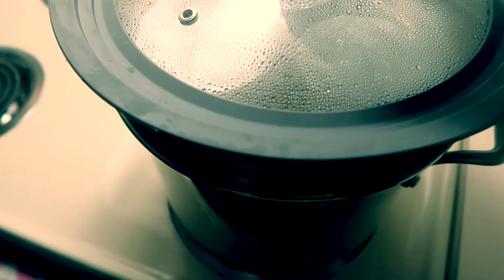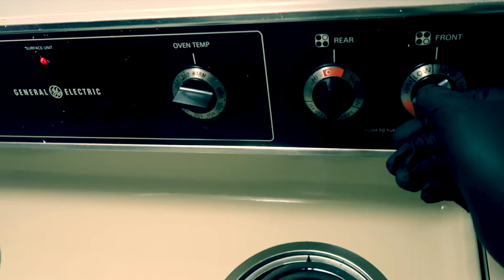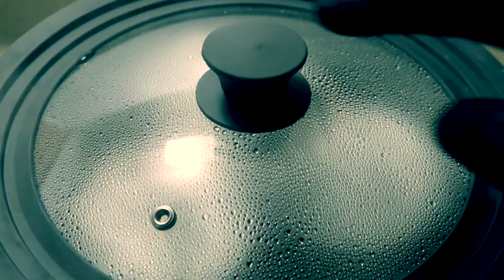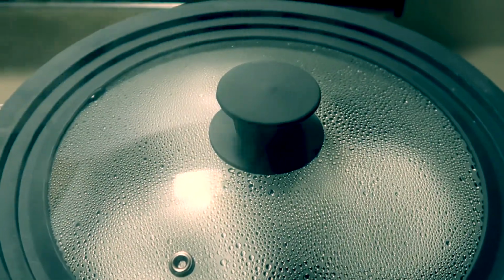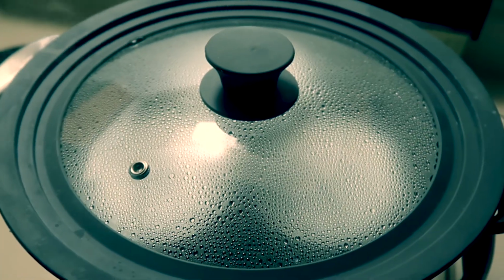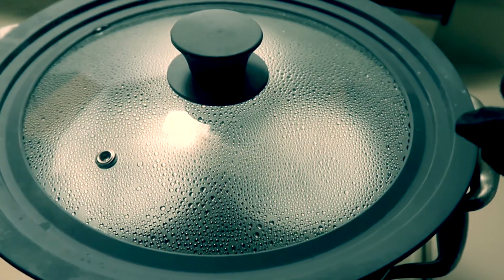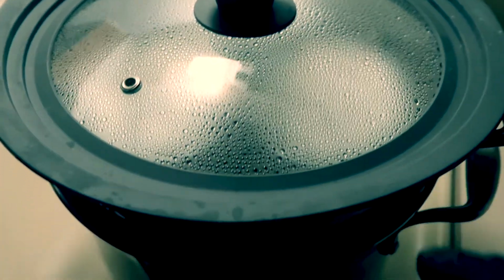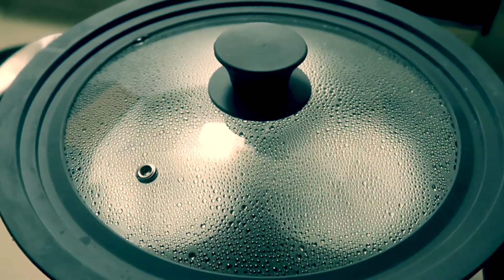Now that this is at a rolling boil, you can see and probably hear it in there. I am going to go ahead and turn it down. Everybody's stove is going to be different. You want just a slow, low simmer for 2 hours. So now I'm going to go ahead and set my timer for 2 hours. Now remember that common sense will almost always prevail here. You're going to want to continue to check on that water level in there for the 2 hours. You don't want it boiling dry, that's going to be a disaster. If you need to add some water, that's perfectly okay.